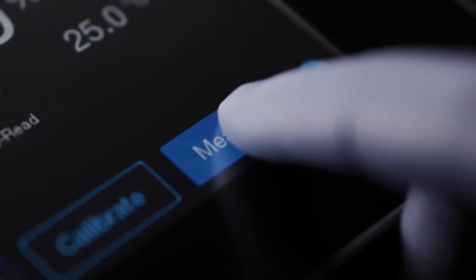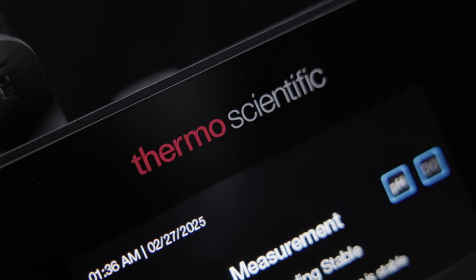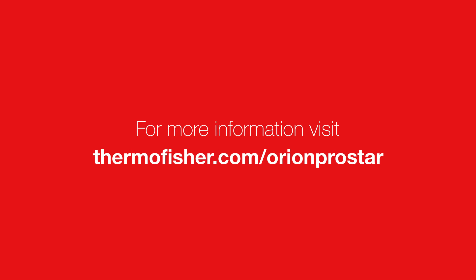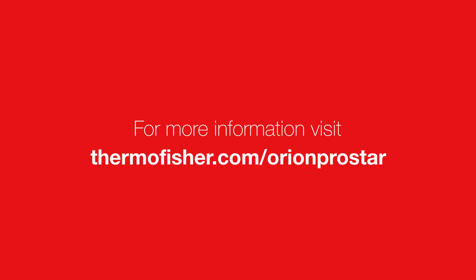See for yourself how the Orion ProStar provides accurate and reliable electrochemistry testing. To learn more, visit thermofisher.com forward slash Orion ProStar.